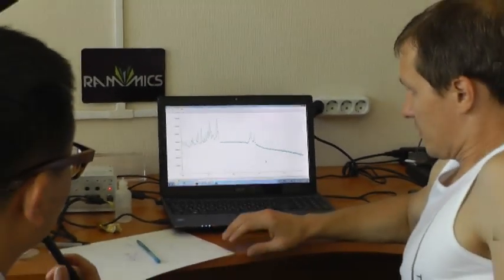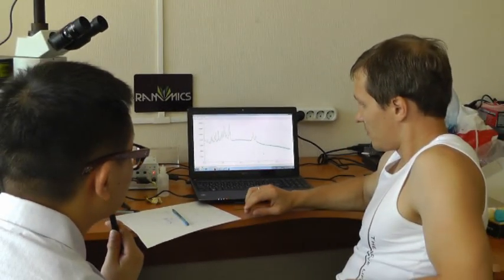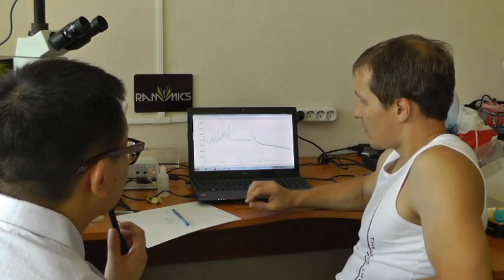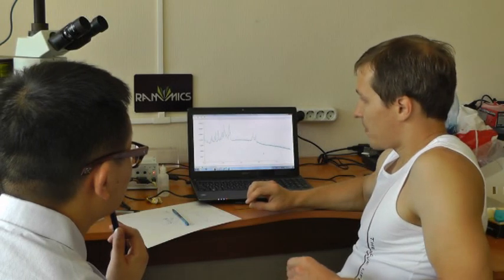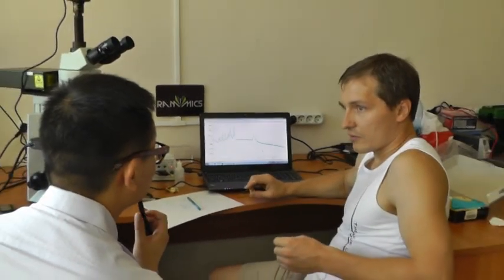And that's all. And also I forgot to show you parameters of scanning, like step size, like how many spectra we skip after each move, like it was in the mapping software.